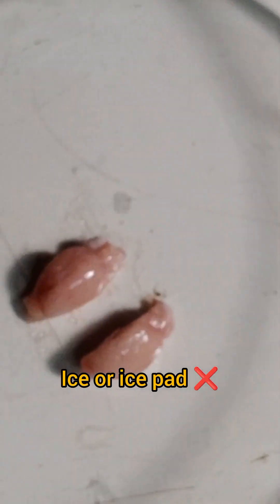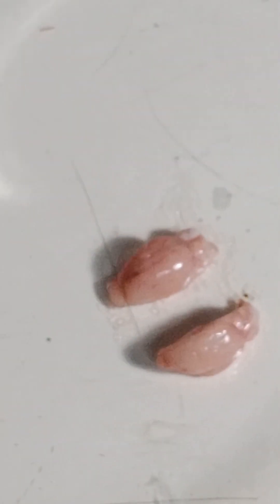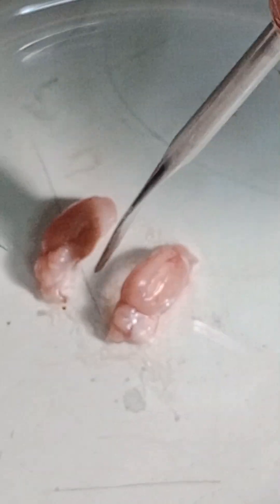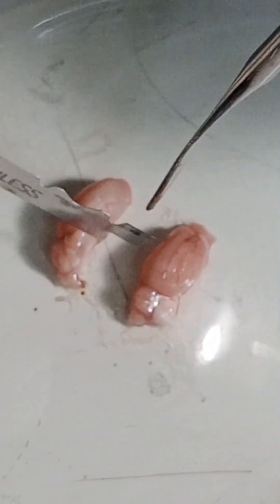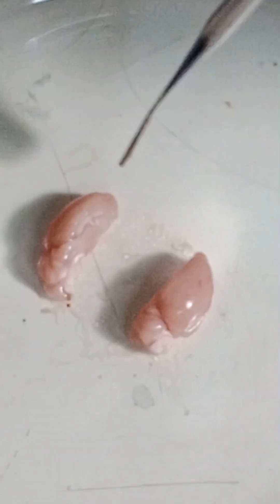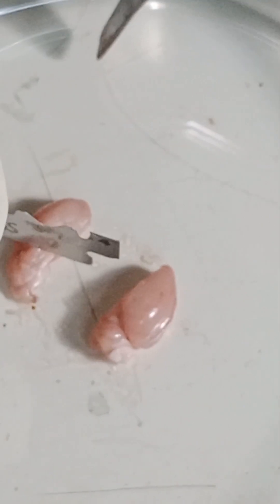Secondly, I will suggest: do not place the mouse brain on ice or an ice pad, because it will be frozen there. When you try to use this mouse brain it will be crushed and you cannot separate the desired part. Here you can see I am separating these two parts.